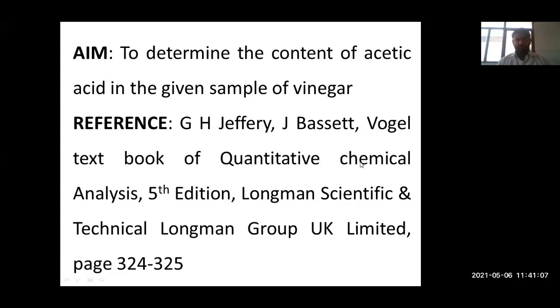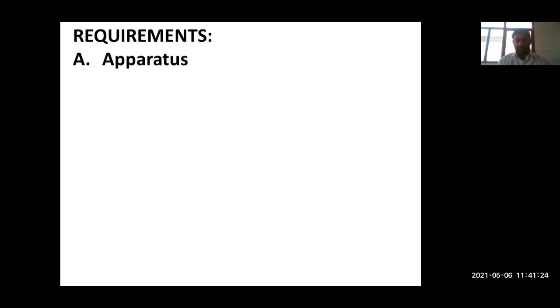The aim for today's practical is to determine the content of acetic acid in the given sample of vinegar. This practical has been taken from Vogel's Textbook of Quantitative Chemical Analysis, 5th edition, published by Longman Scientific, page number 324 to 325.